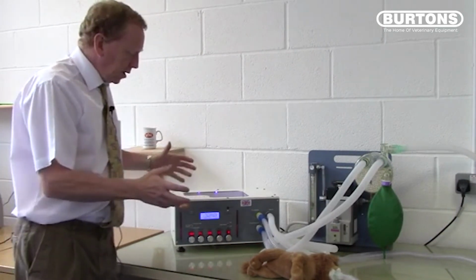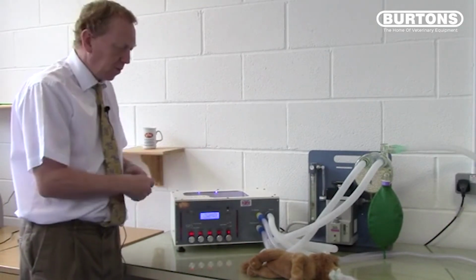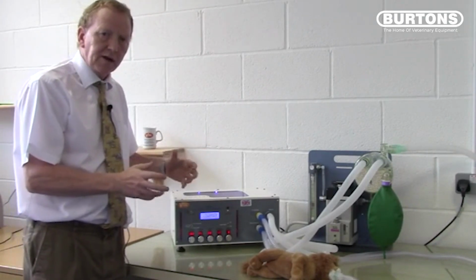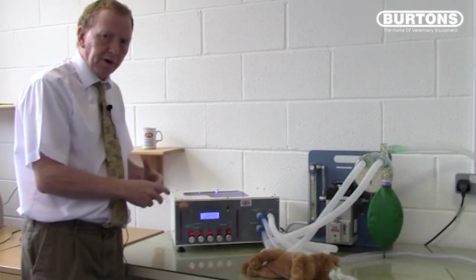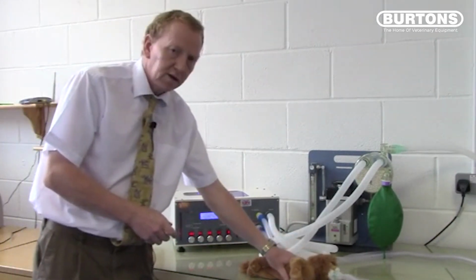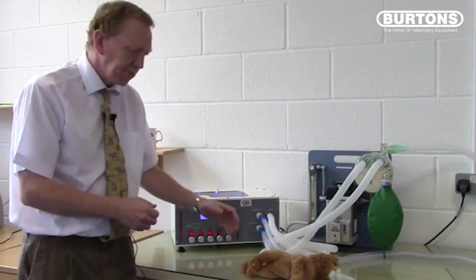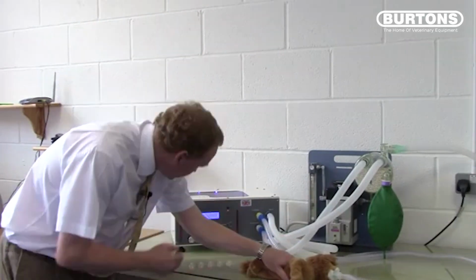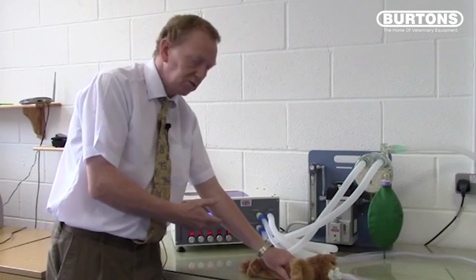And so you may say, well, why would I do that? They're exactly the same. It's a lot easier to volume cycle. I can calculate volumes easily. Why would I pressure cycle? The interesting thing, or the most useful feature of pressure cycling, is as the animal gets smaller and smaller and smaller, the protection ability afforded by pressure cycling becomes more apparent. If I now occlude the chest, the pressure still did not rise above 12 because we're targeted for 12, and I just delivered a much lower volume. And in that instance, 90 mils was delivered. There's no interference to the function of the ventilator. It's behaving as it normally would.